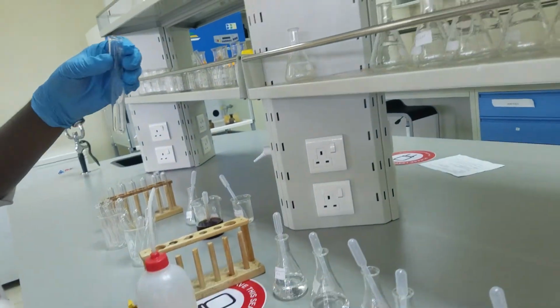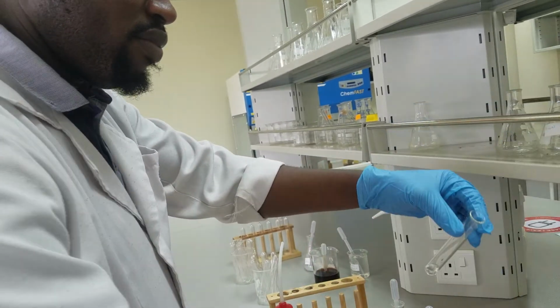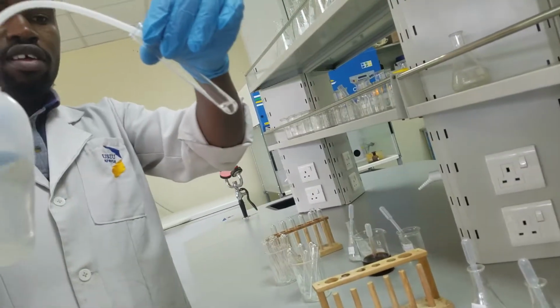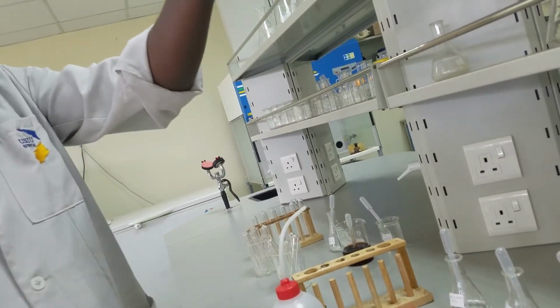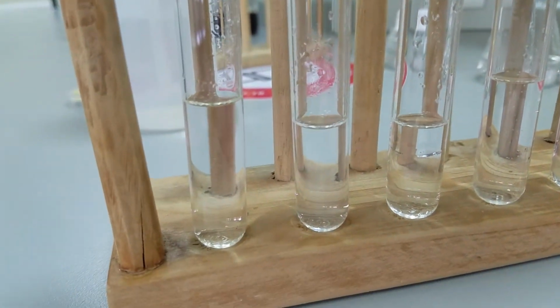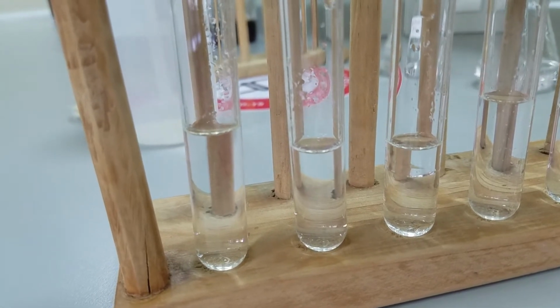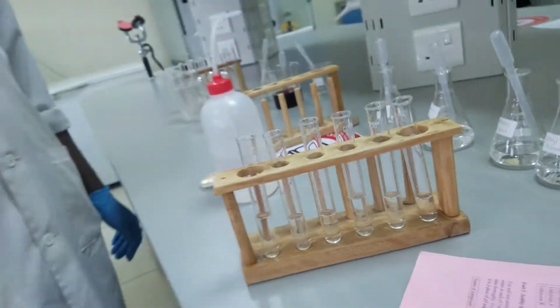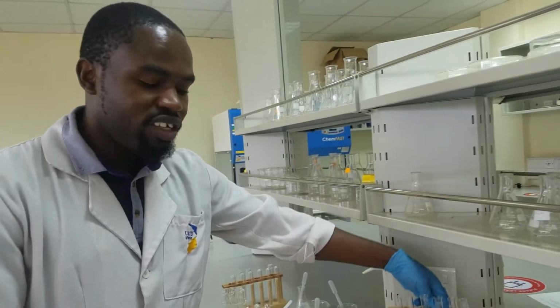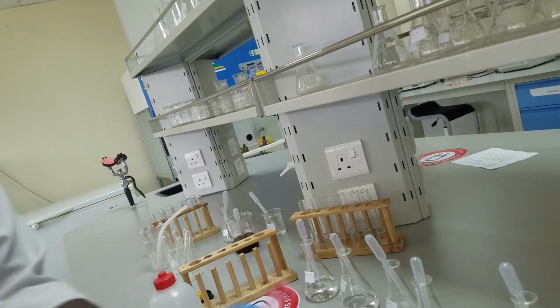Okay, then we go to our second unknown, unknown C. Add a few drops, then distilled water. See if there are any observable changes, and see if you are able to identify our unknown from our knowns. If that is not possible, if you can't identify using their solubility, we go to the second test, which is acidity.